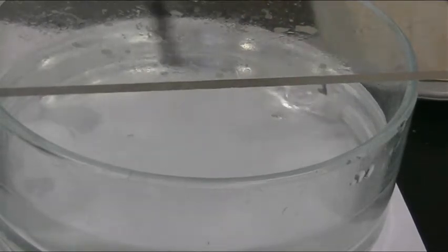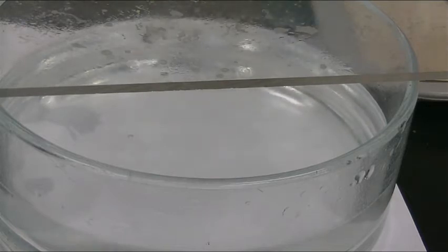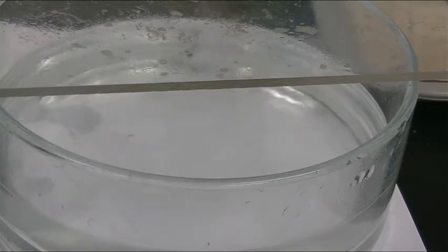And it's kind of running around on top of that gas layer that it's forming. It's producing hydrogen gas. It's effervescing, if you will. Just a cute little guy. He's just a little ducky swimming in the pond. Swimming around.